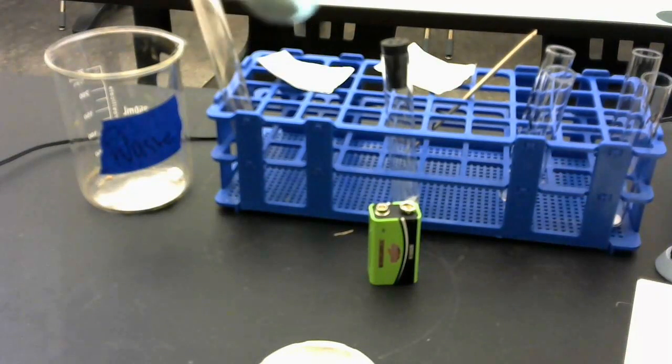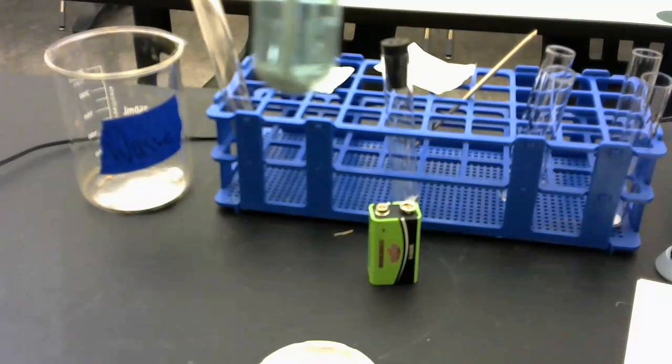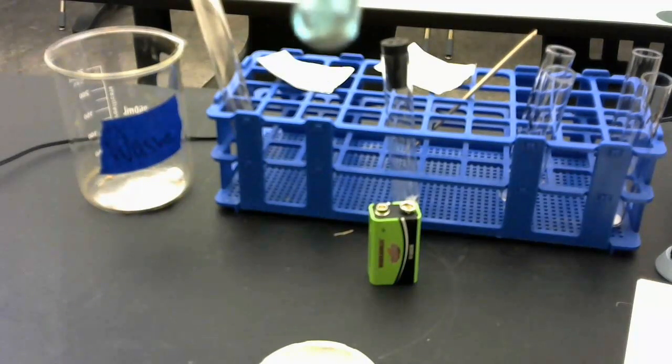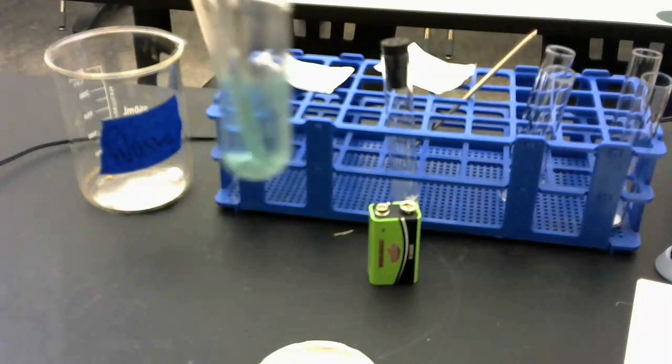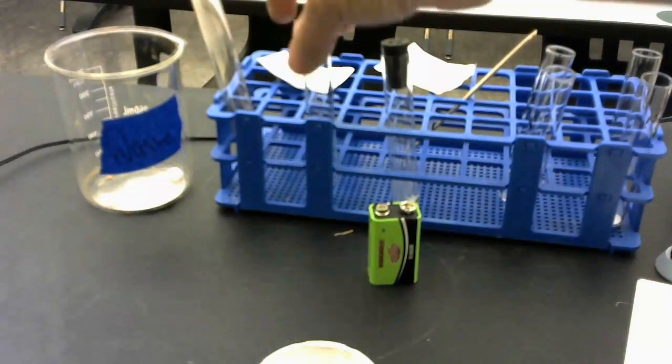And that's just going to continue to react while I'm going through this lab. I'm creating more silver because I took the silver metal off, and so I exposed more copper to that silver. And you can see that that solution is getting more blue also as you go on. So make sure that you add that to your observations.